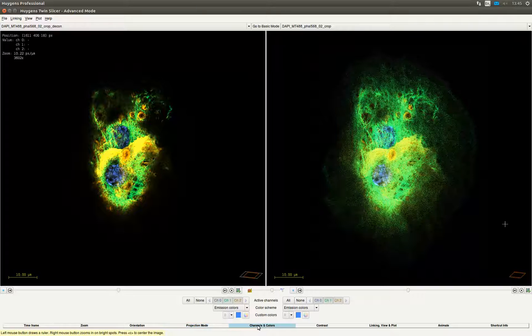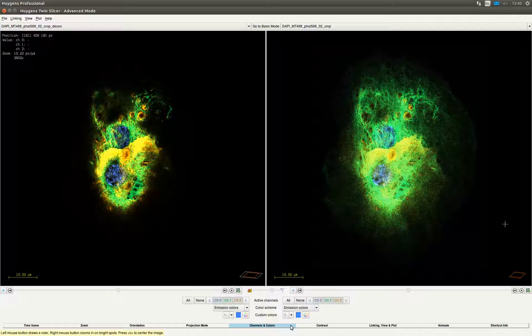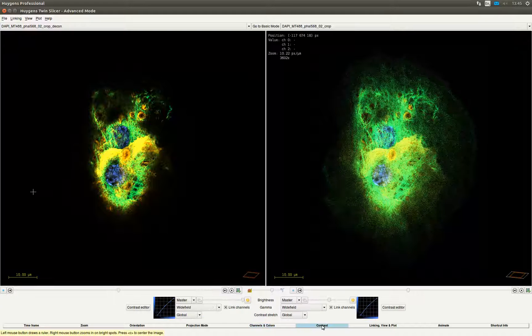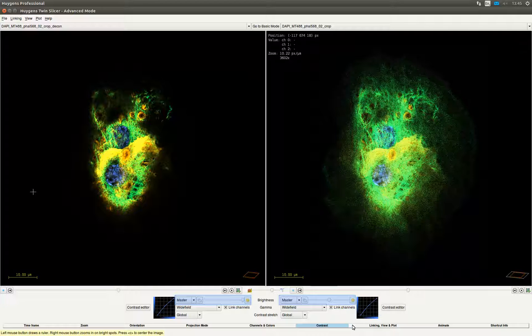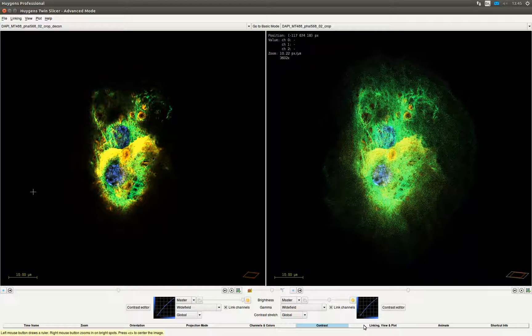Within the channels and colors you can activate and deactivate channels of the images to be displayed as well as setting specific colors for each channel by either selecting a color scheme or custom setting the color. In the contrast tab you can change the brightness of each channel or of the complete image by dragging the slider and selecting the channels. The gamma can be set to linear or to several non-linear modes of mapping data values to pixel intensities. You can also open the contrast editor to adjust the contrast manually.